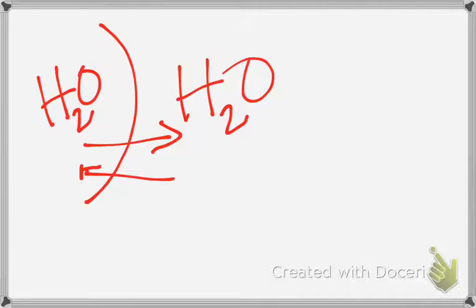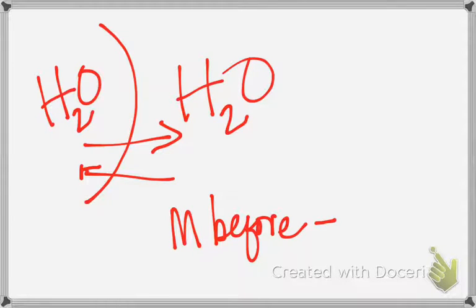You made some qualitative observations on your lab sheet. You should have below your data table what those solutions looked like. Were they extra thick? Were they less thick? What was the appearance of the egg? But then you also took a quantitative measurement. Quantity means numbers. What numerical value did you collect? The mass. You had the mass before and the mass after.